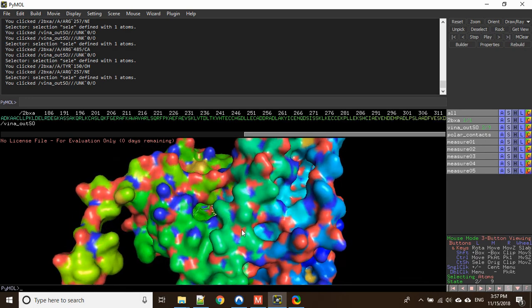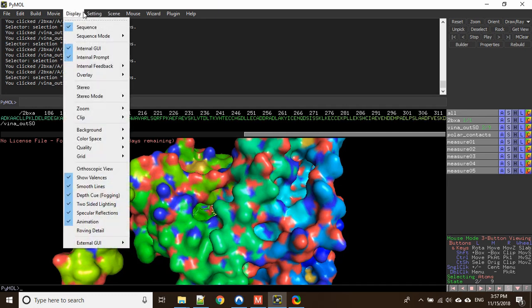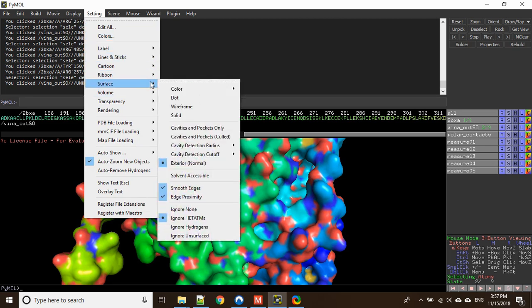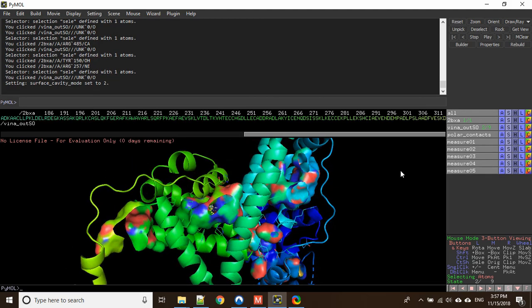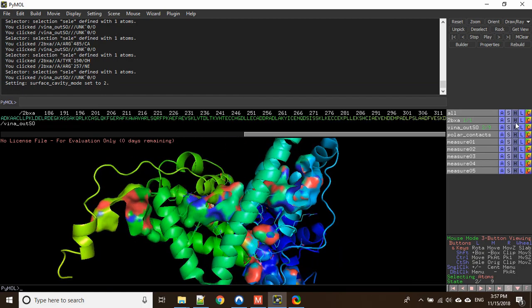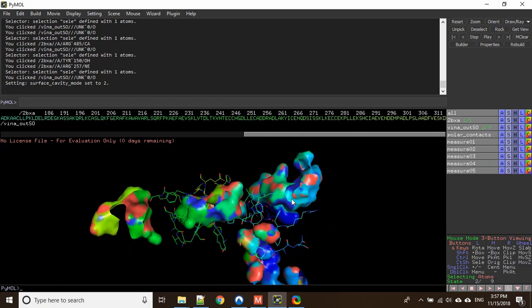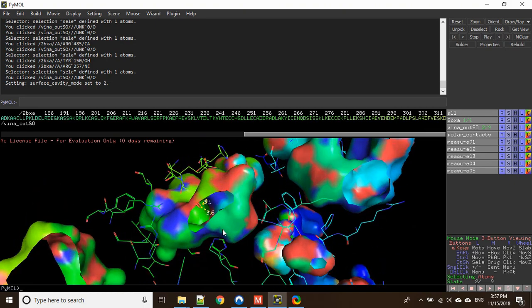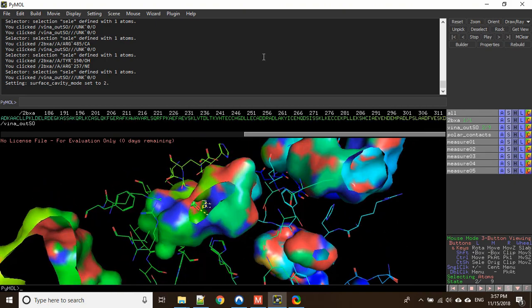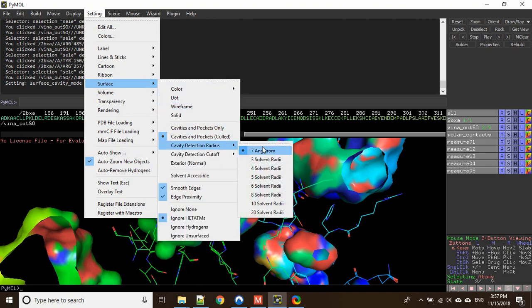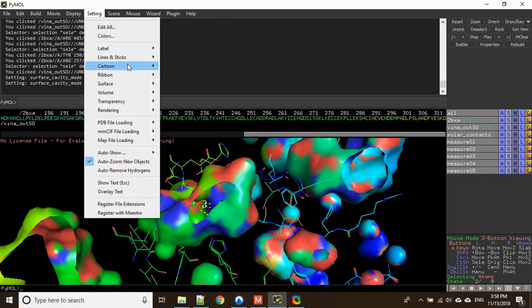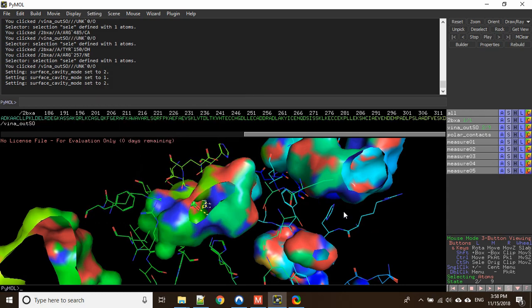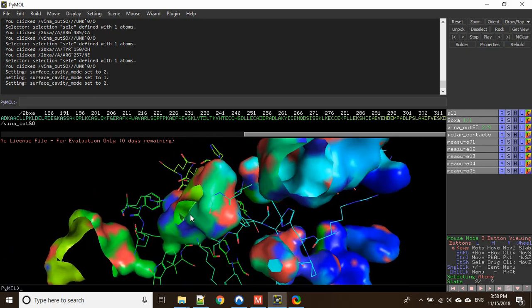Another option is if you don't want to remove these atoms, you can change some settings. Go to Settings > Surface, and you can see 'Cavities and Pockets Only' — then it will show you the binding pockets. I'm going to hide the cartoon. This is now my binding pocket. You can also set the radius of your surface.